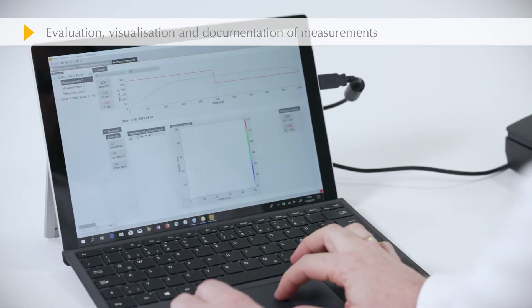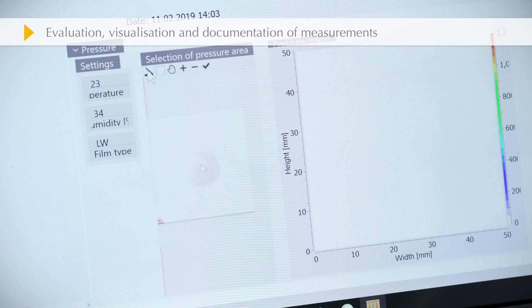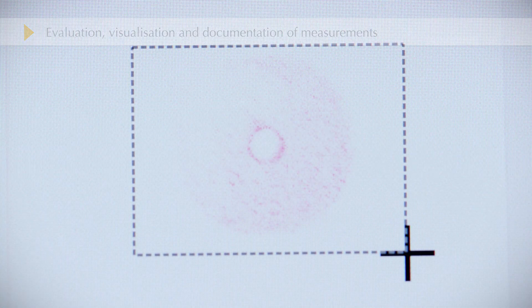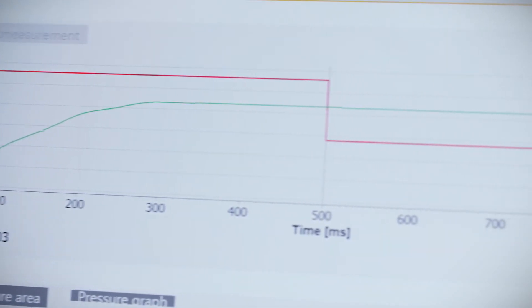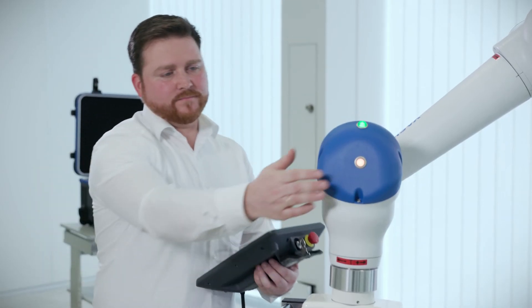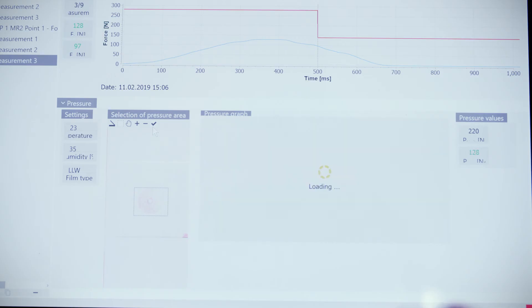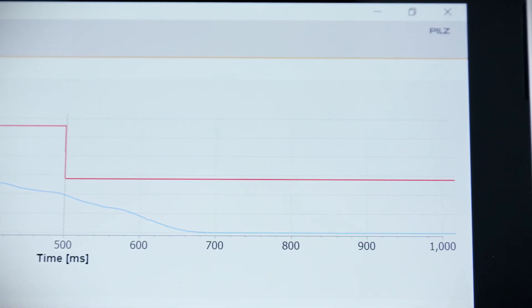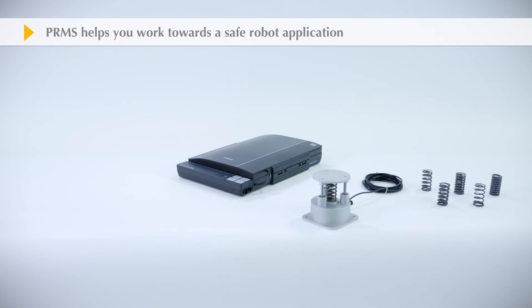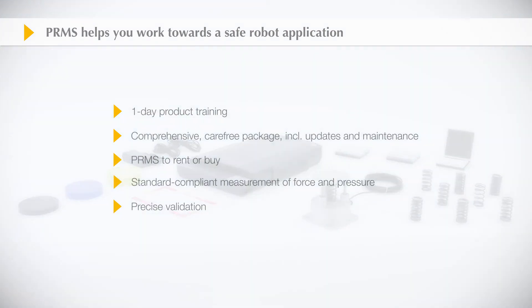Force and pressure are evaluated using the software supplied. If the values are outside the specified limits, the robot parameters will need to be corrected. HILT's robot measuring system PRMS helps you work towards a safe robot application.